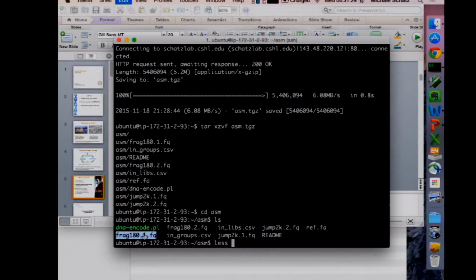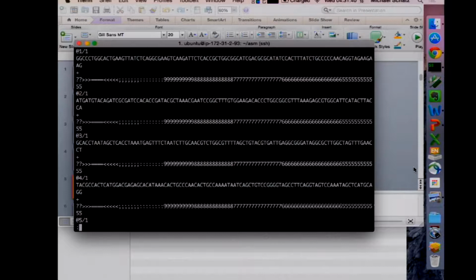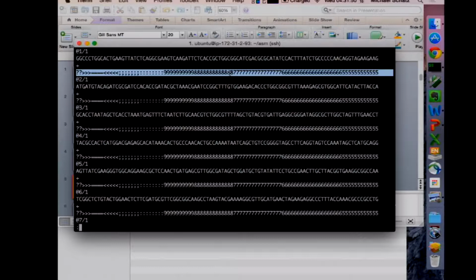These are simulated reads. So the FASTQ file is going to look kind of weird in the sense that we have DNA characters, and then we have these weird quality values. That's just because I used a simple simulator that gives a simple quality value string. It doesn't try to be all that realistic. It goes from very high quality bases to low quality bases.